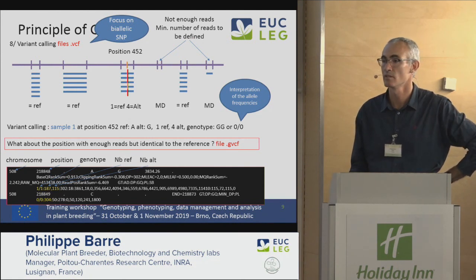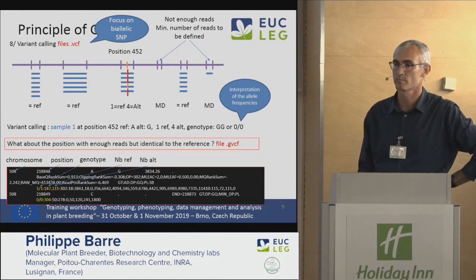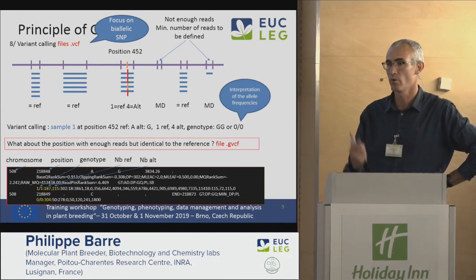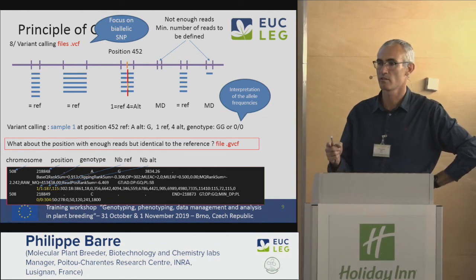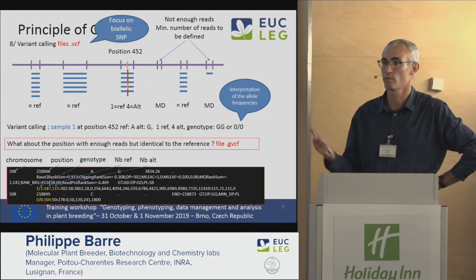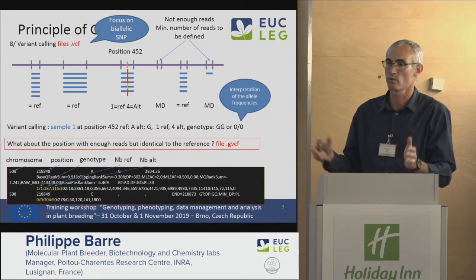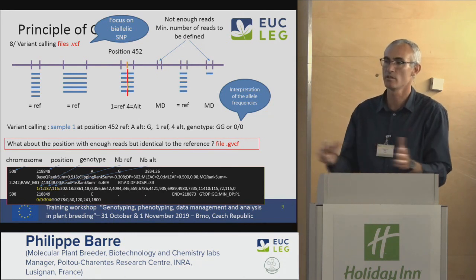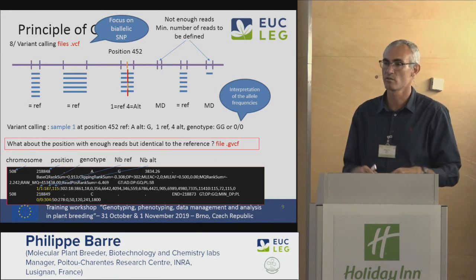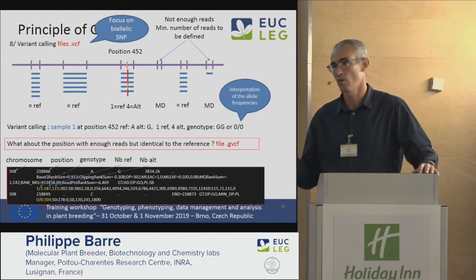I have one maybe stupid question. You said that it is quite demanding in memory. Do we need a supercomputer for computing that? Yes, you need both, in fact, but I will come back to that a little later. You need two things. You need hard disk memory, a lot of it, because you have big files and you compress and decompress, and so you produce new files. In addition to that, you need a lot of CPU, so computational power to do all the work.